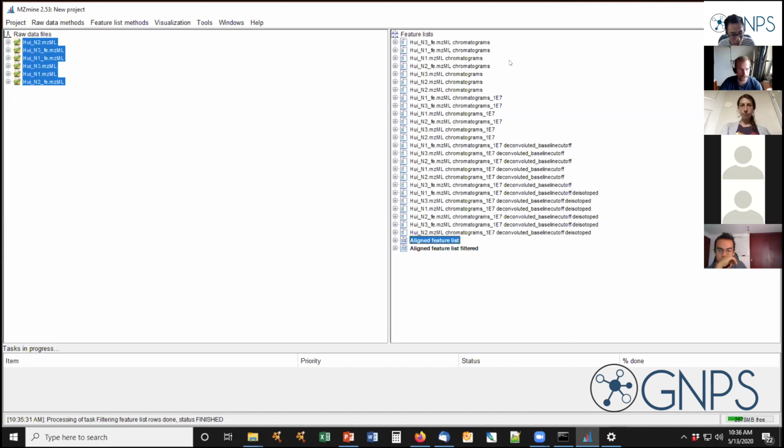Yes, I think there is a deconvolution algorithm with ADAP as well, but that would definitely be something for the breakout session, especially as we are running a little late and I want to finish this now so we get our MGF file and CSV file, because we are almost there.